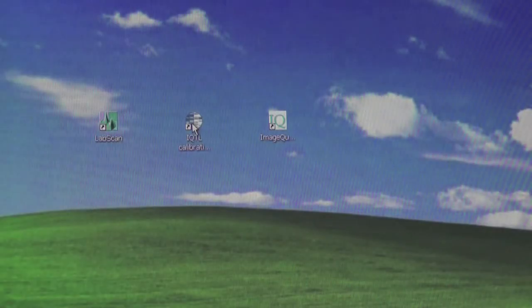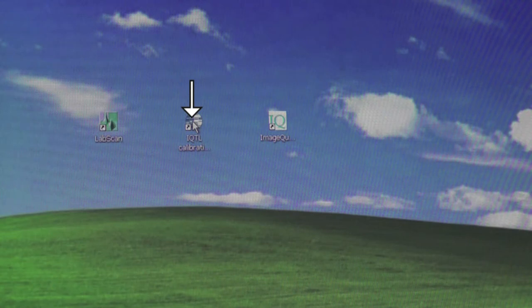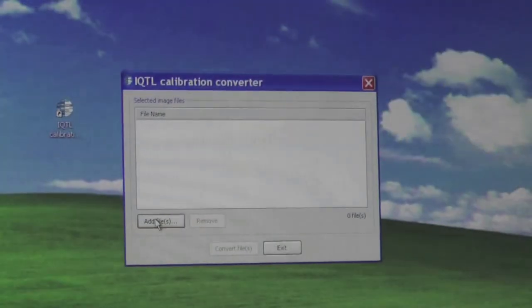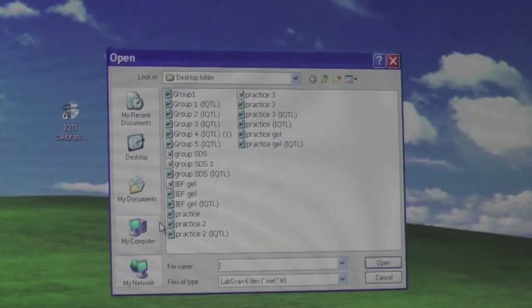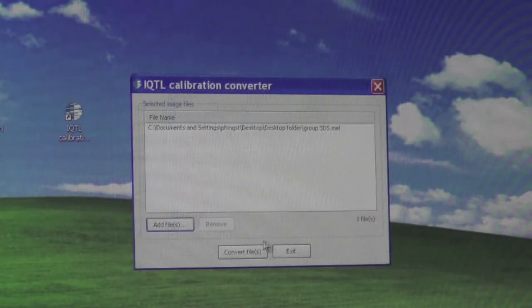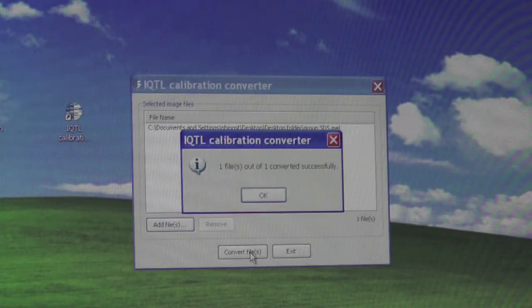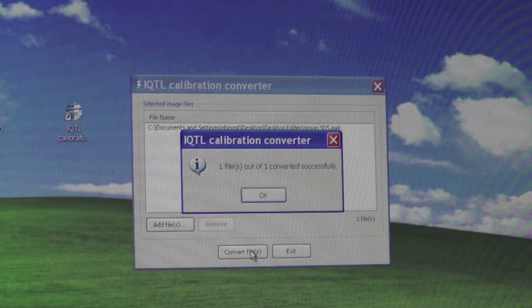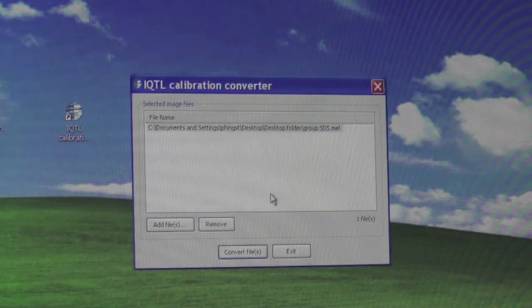The gel images need to be converted in order for the analysis program to easily detect the bands. To do so, open the IQTL calibration converter. Click on Add File and select the image file you saved. Click on Convert File and a notification will appear after the conversion is complete.